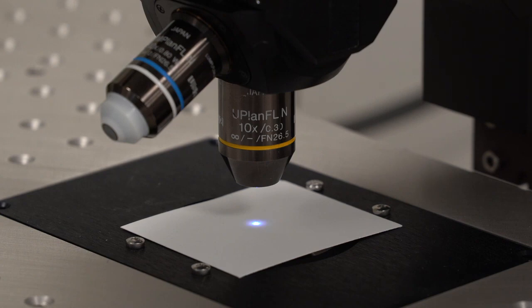The LED cubes that we offer range from 285 nanometers to 940 nanometers. This one has a 340, a 480, a 561, a 385, a 440, and a 530.